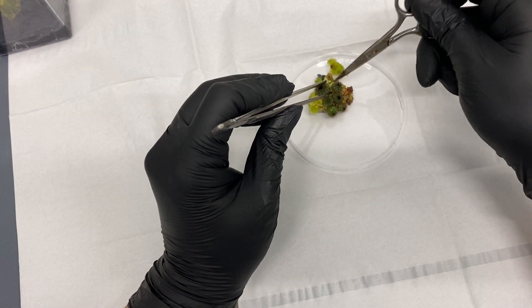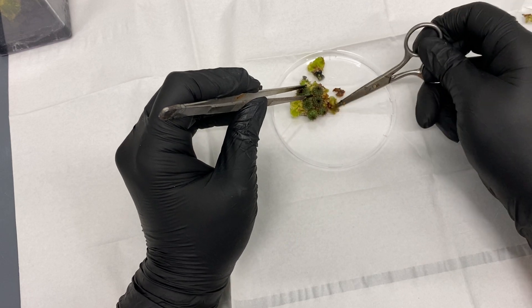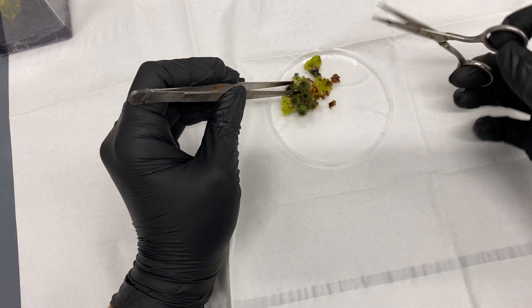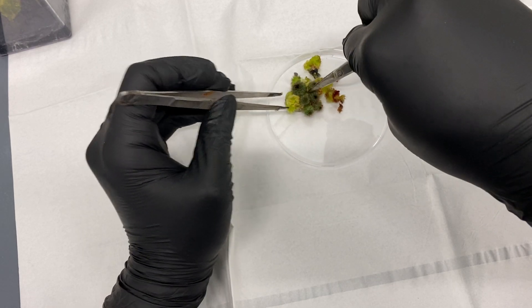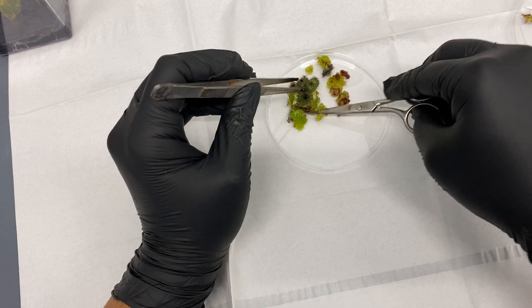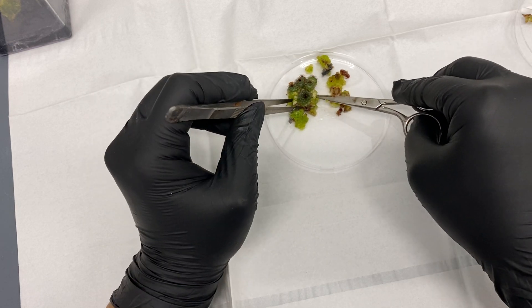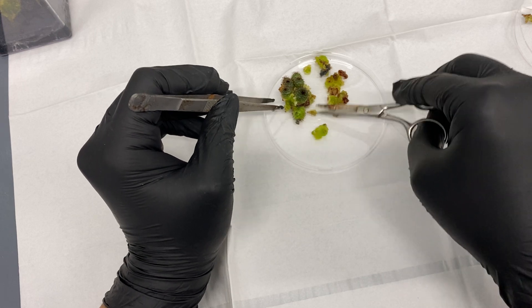I'm pushing off this callus that just wants to fall off. It looks kind of — I don't want to say dead, but filled with metabolites. Whenever you see that dark color it's usually a lot of antioxidants or starch granules — nothing to worry about, but not something we really want.